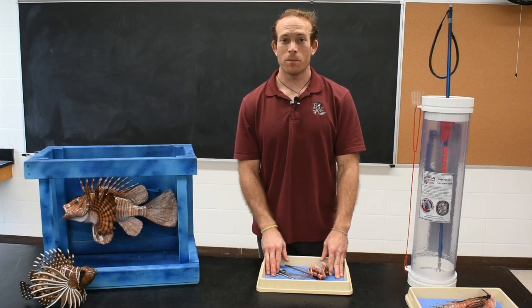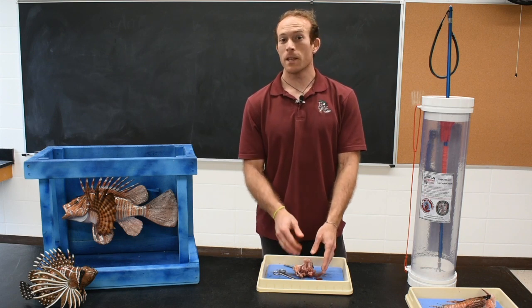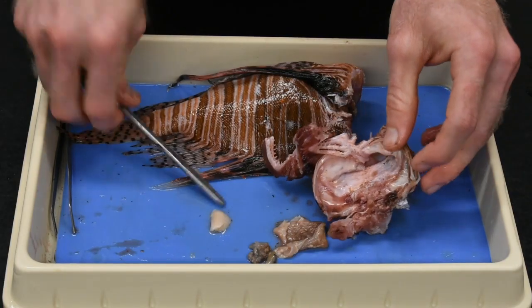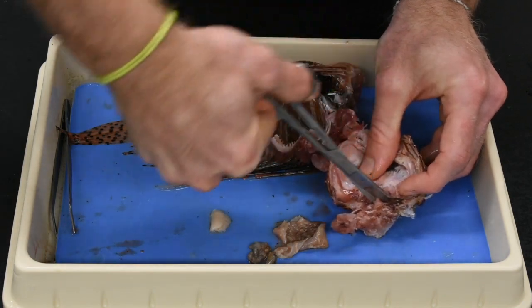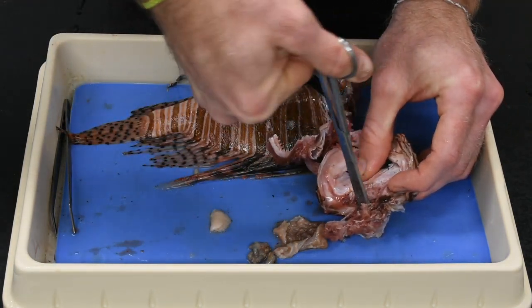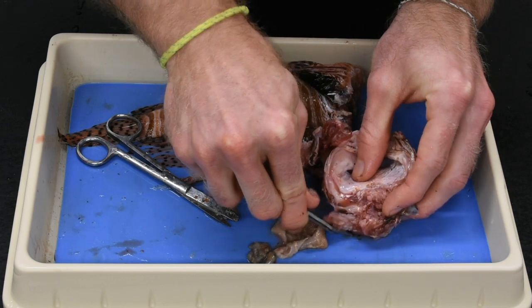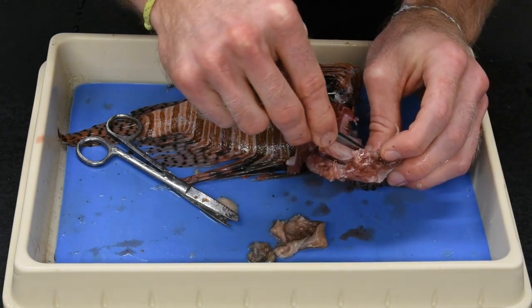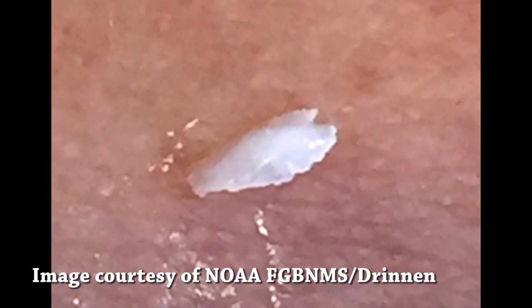One of the other procedures you can do in a lionfish dissection is to remove the otolith bones. Here in the cranial cavity of the lionfish, right at the base of the spine, there is a small cavity filled with fluid that houses two otolith bones. These bones help balance the fish and provide stability, and they also deposit annuli rings from which you can determine the age of the fish — a very accurate method for scientists. To remove the otolith, the head must be removed, then the gill rakers and structure cut off. There is a small bubble — the cavity itself — at the roof of the mouth just before the esophagus starts; you crack that open and inside is the fluid and the otolith bones, which can then be removed.